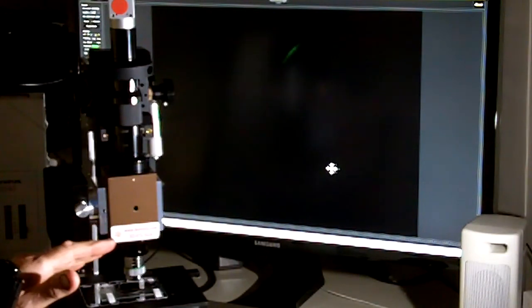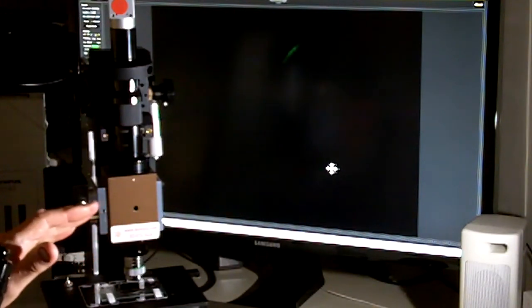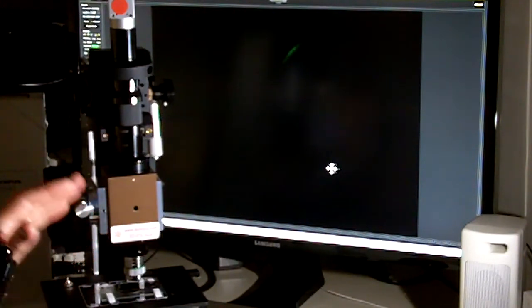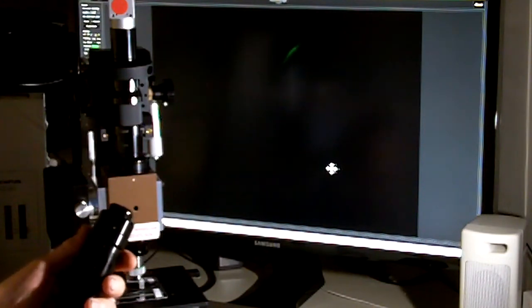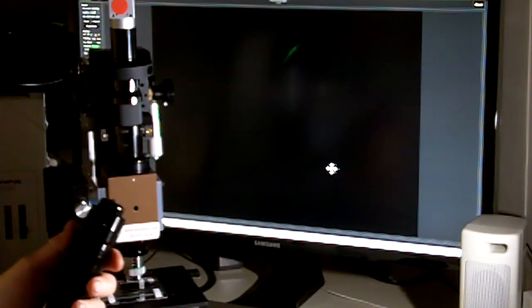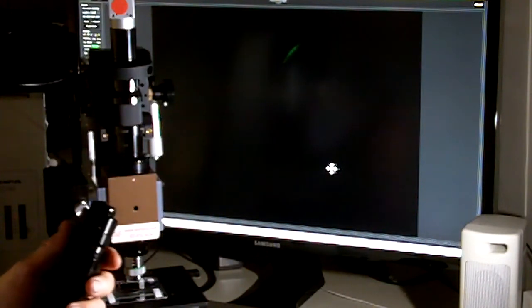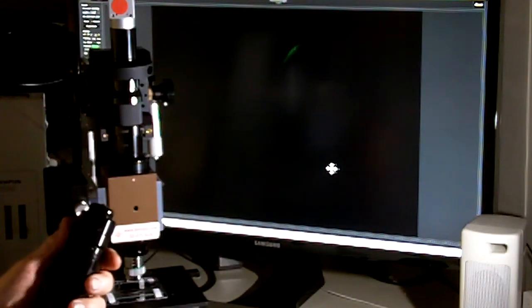So this not only allows you to visualize and do real-time high-speed recording to do slow-motion studies, but this system is intended for use with either a monochrome camera, which is the standard camera, doing 266 frames per second up to 2,700 frames per second.